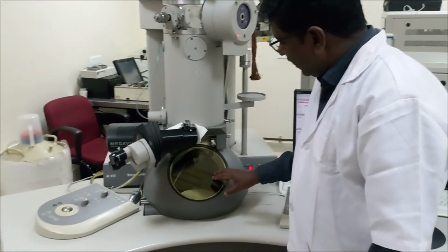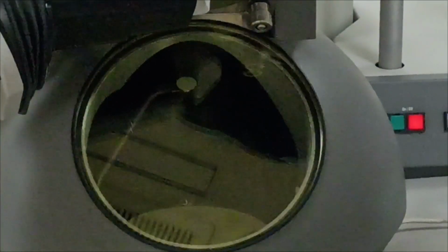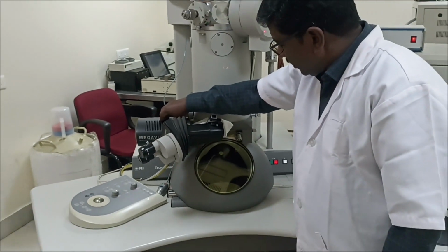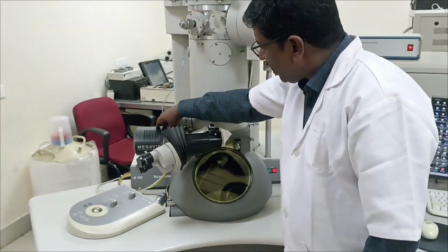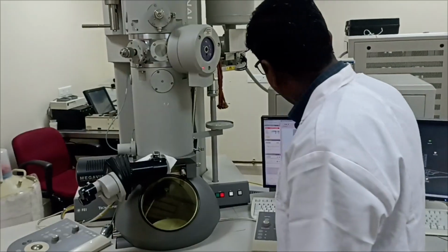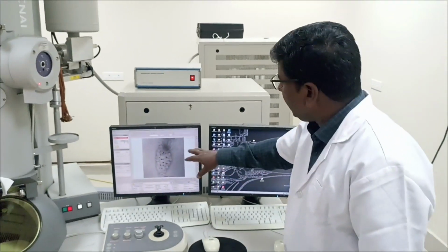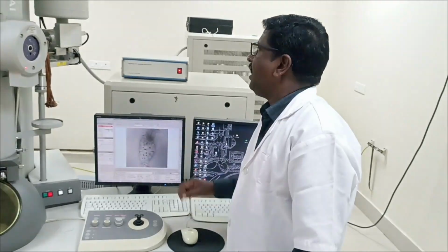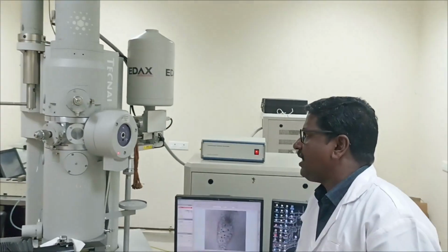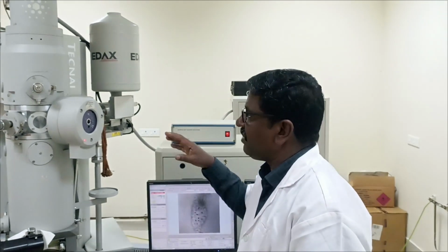Here, on that screen, the electrons will be projected, and next this is called the camera. The camera is used to capture the shadow image, and the camera is connected with the computer system. Where we have the image, after recording, the image will appear here. And this is called the Dewar cylinder, and this cylinder is filled with liquid nitrogen. The purpose of liquid nitrogen is to keep the sample always cool.